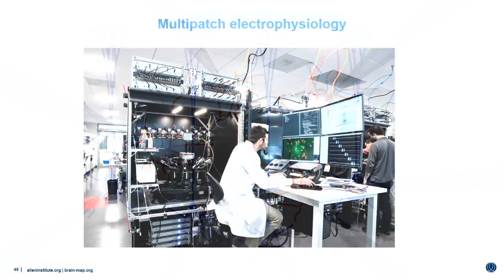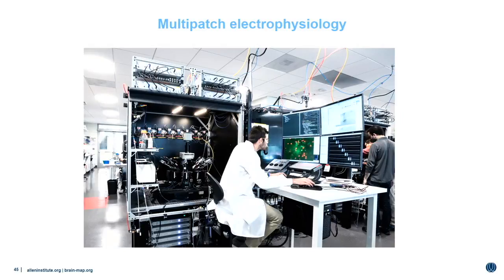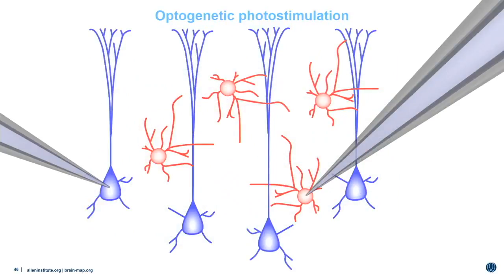And we built a pipeline out of this technology. We've got a few of these Octopatch rigs that have been collecting data for almost a year at this point. In a few minutes, Alex is going to tell you all about the work we've done there. But first, I want to tell you about one more technique we have to speed this up.